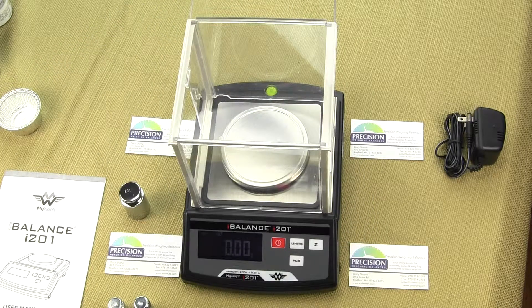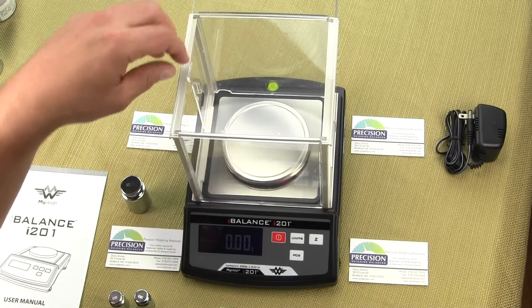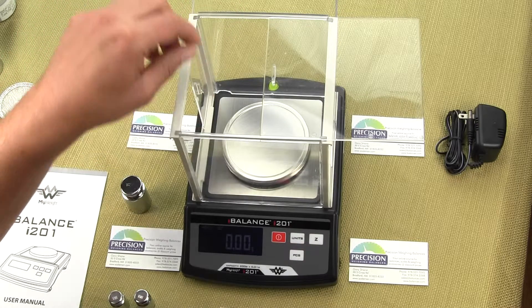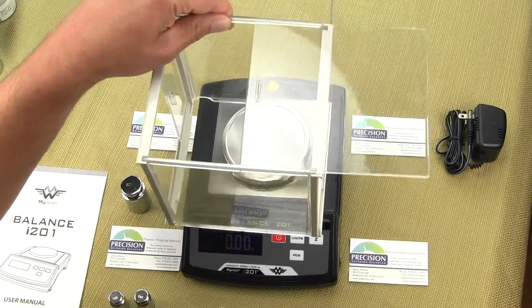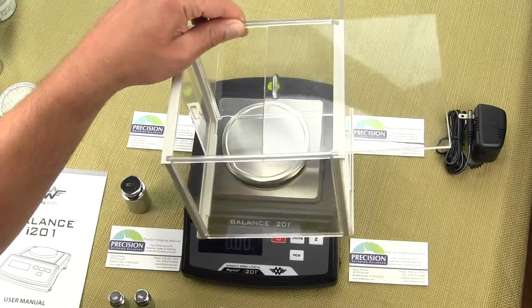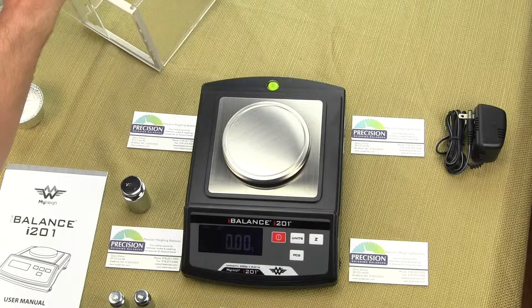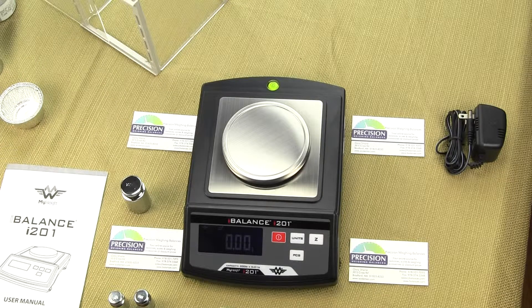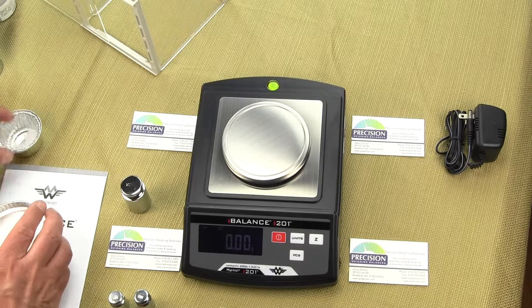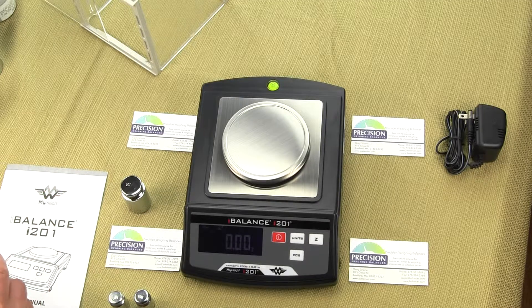This is the new version 2. You can see it comes with a windshield that you can open from the top and from the right or left side — it's a plastic windshield. We're going to remove it for this demonstration. The windshield prevents any air disturbances that could affect the weighing of the object. This is a scale that goes to a hundredth of a gram.